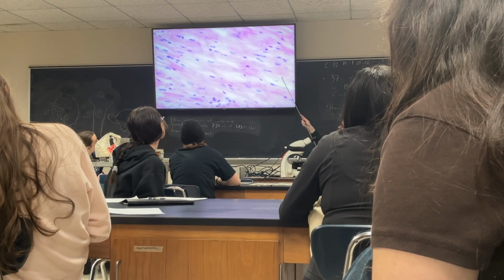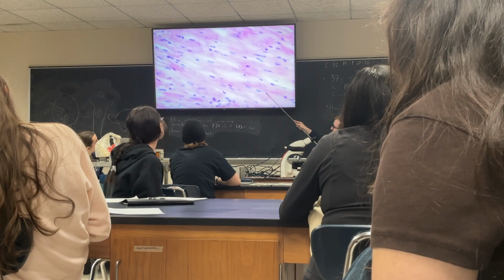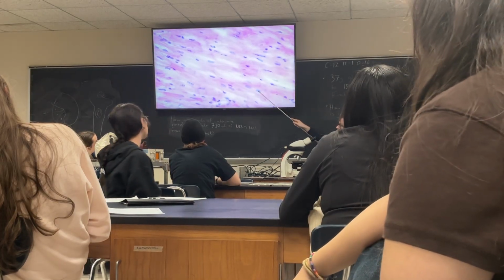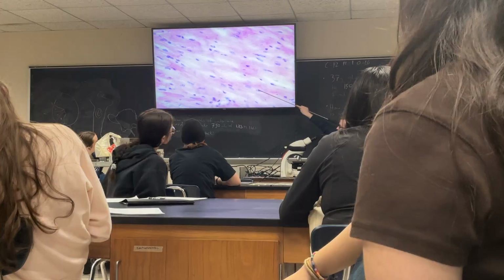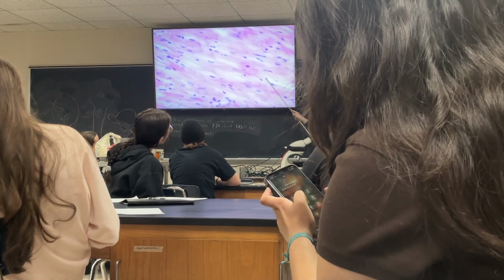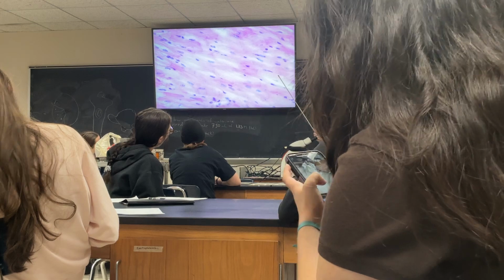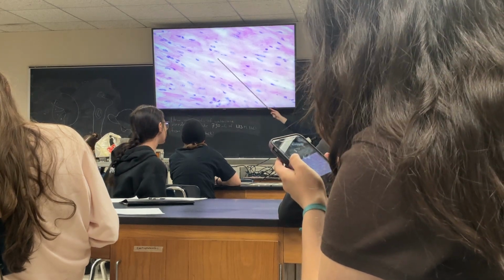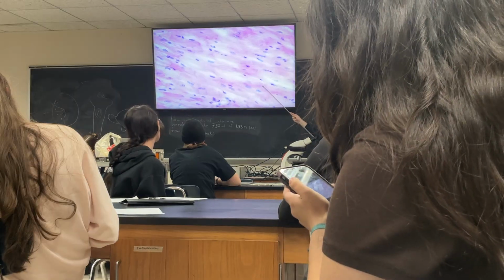And then I look at this and I see, well, there's like a clearing on either side of this. If it were skeletal muscle, that wouldn't be there. You'd have the cells squished back. They'd all look like that one. But most of these nuclei, let's see, like this one, have a clearing on either side of it. Okay, and then what are these?